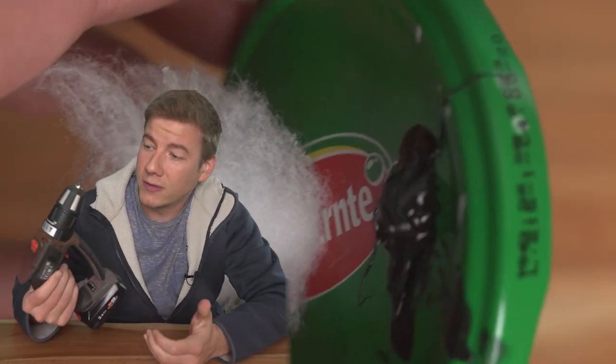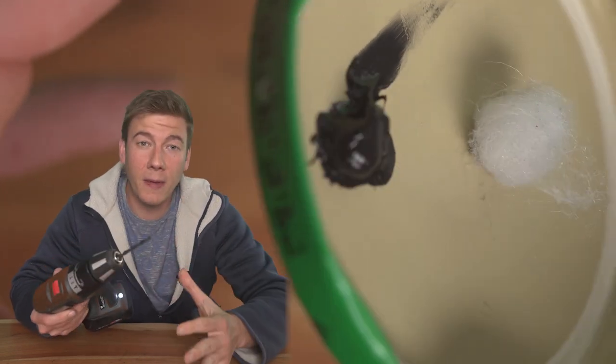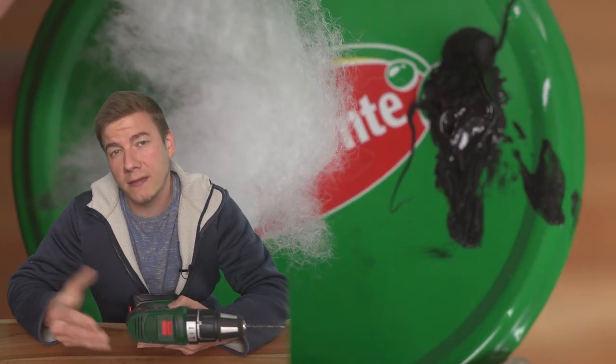Now we just need to drill some holes. I'm using a diameter of four or five millimeters so that there's enough space to use a needle, for example, which is a little thicker.